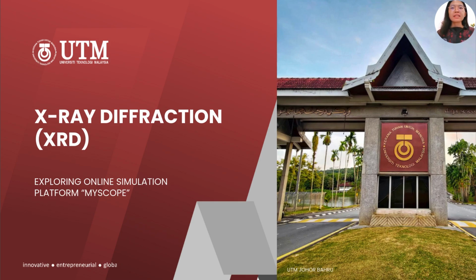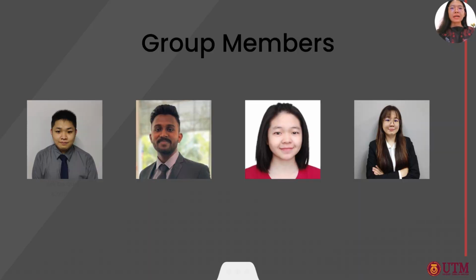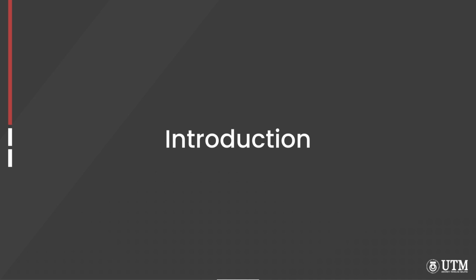Hi everyone, this is an educational video exploring X-ray diffraction using the online simulation platform MyScope. Our group members are Ketakwan, Dinesh, Shinzuru, and Wenminro.